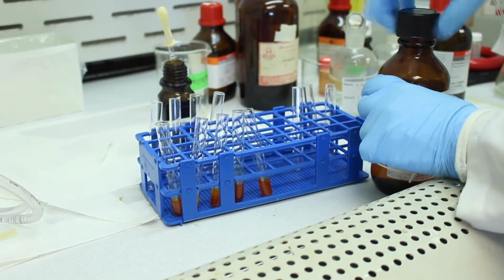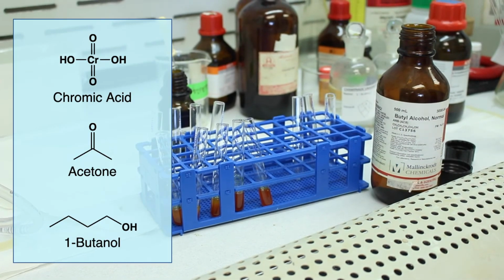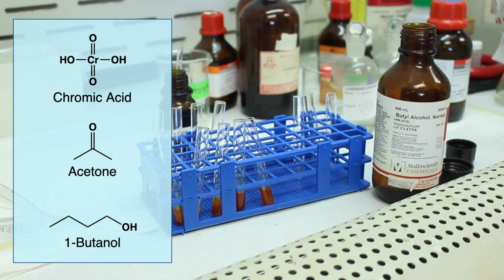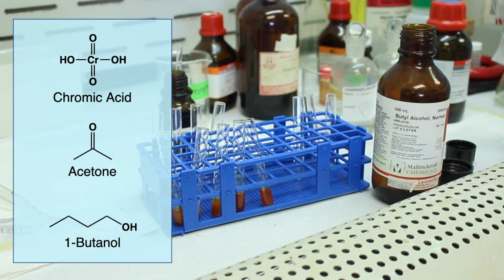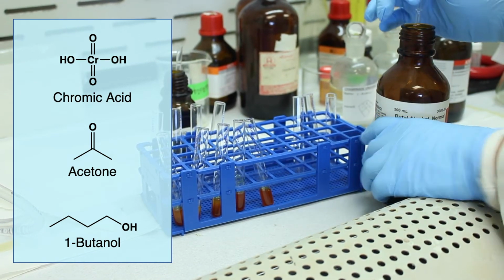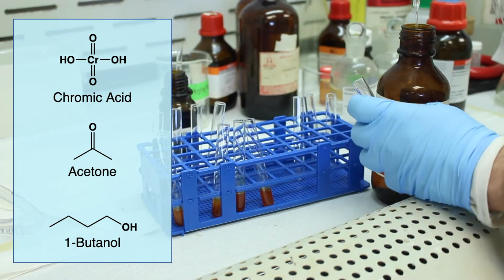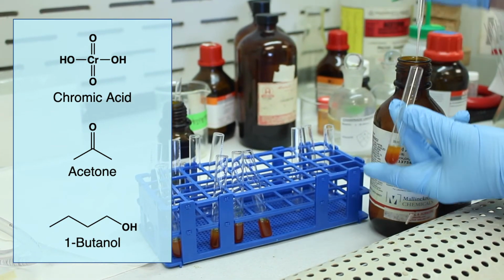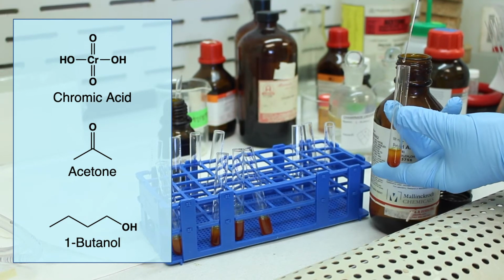We'll start with butyl alcohol. So this is n-butyl alcohol, a primary alcohol. So our expectation is since it's primary, it has alpha hydrogen and therefore it will react with chromic acid. So grab a little bit, you don't need very much. I'll hold it up like this. Okay, we can add some.